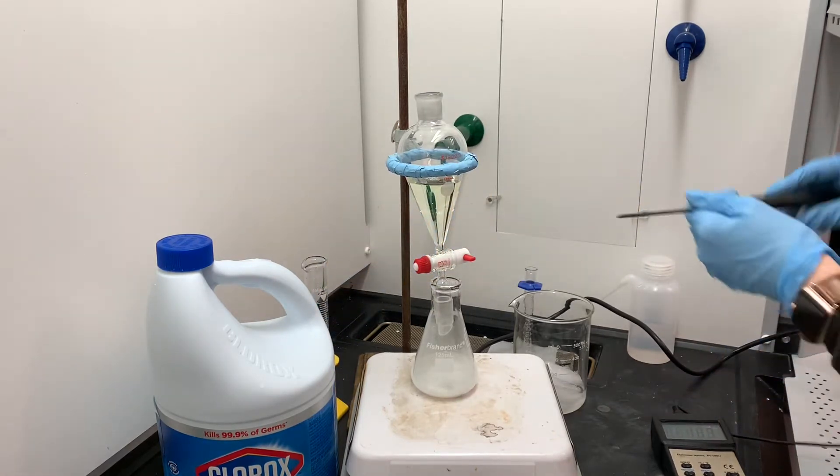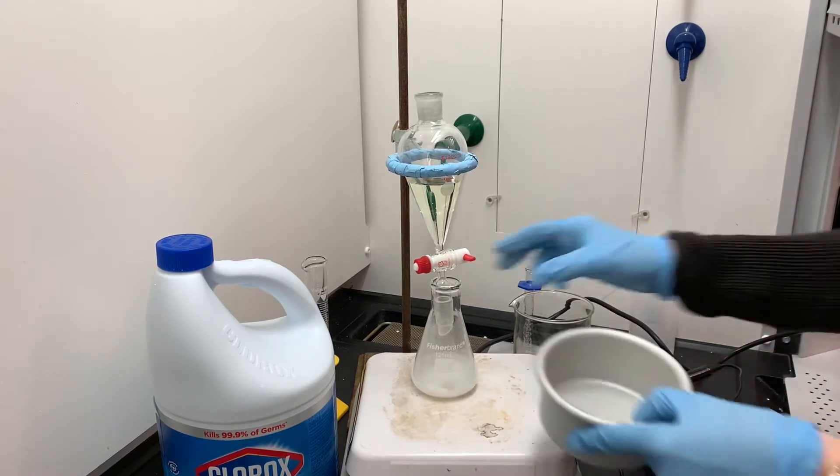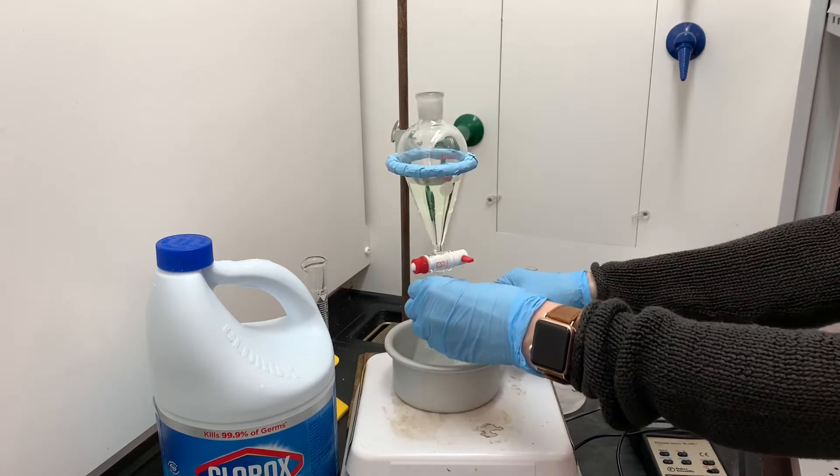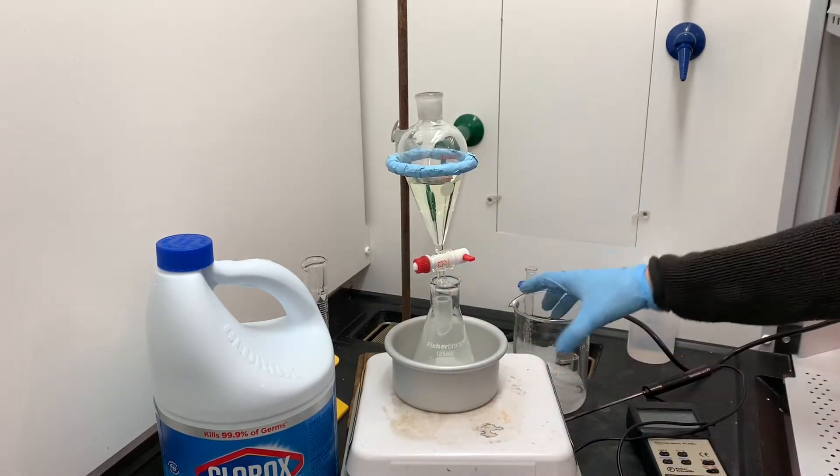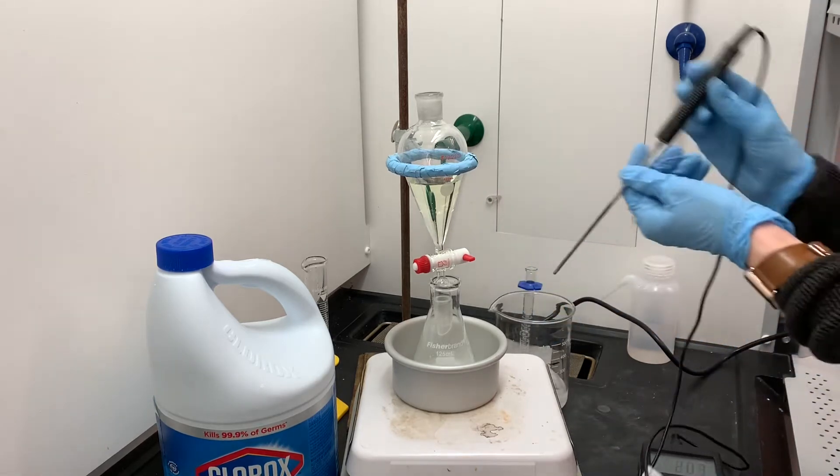I'm going to be monitoring the temperature by putting the thermometer directly into the Erlenmeyer flask, and just in case the reaction gets too hot, I'm going to place this metal dish underneath the Erlenmeyer flask and I'll be able to create an ice water bath right away just in case the temperature gets too hot.